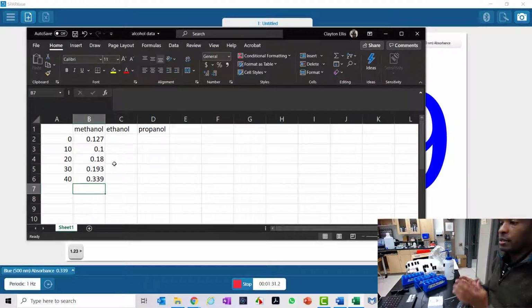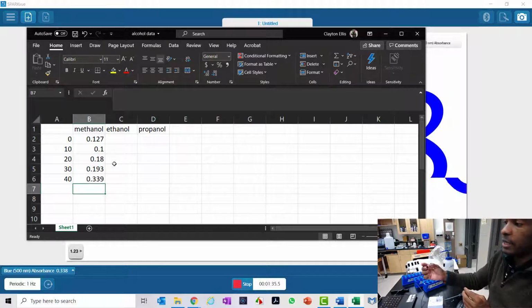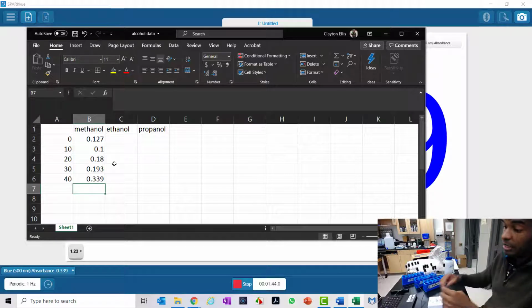So when I cut my beads, my premise is that each of my little bead pieces that I cut, they're all exactly the same. But obviously, I'm not that accurate. I wasn't using a very fine piece of equipment. I was using a big giant butcher knife and then cutting them to the best of my ability. So there's going to be some discrepancy there as well.